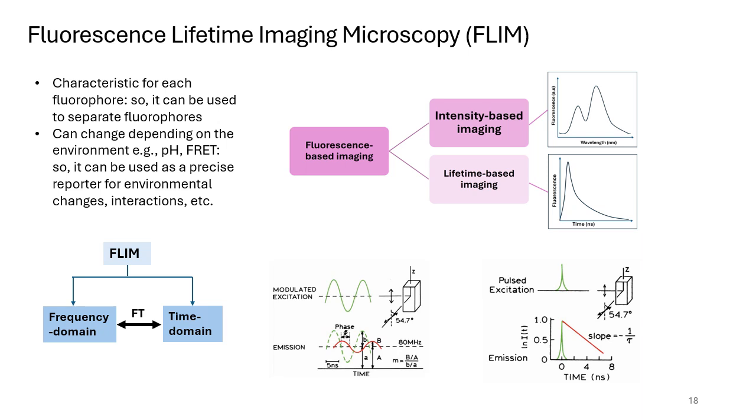So now it is another microscopy which is known as fluorescence lifetime imaging microscopy, which is based on this fluorescence lifetime. Again, when two fluorophores have overlapping emission spectra, it was previously very difficult to distinguish between them. But they can be easily distinguished from their fluorescence lifetime, as it is a molecular property.